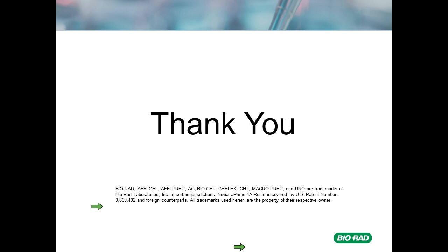Okay, great. Thanks, Mark. Has hydroxyapatite or CHT been used in the purification of viral vectors? Yes, it's been used continually in the purification of viral vectors for many years now. And as I indicated, all I can tell you is that it's in many, many, many licensed processes. I can't really reveal the number.